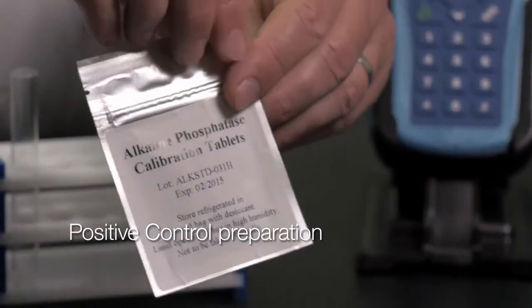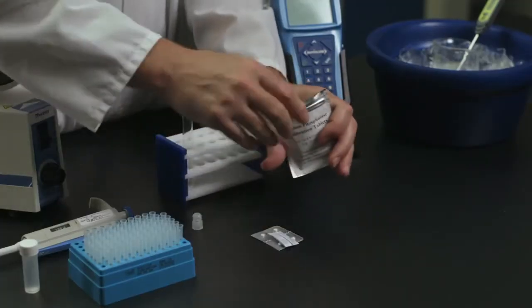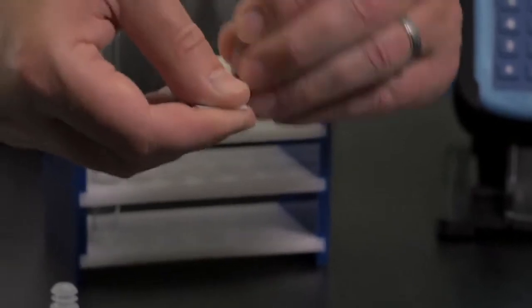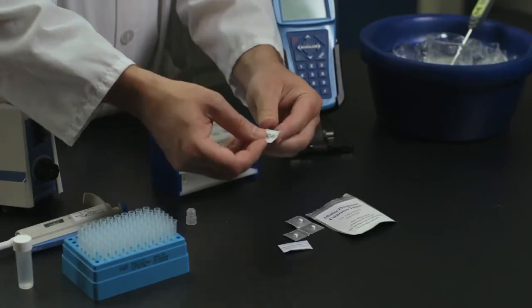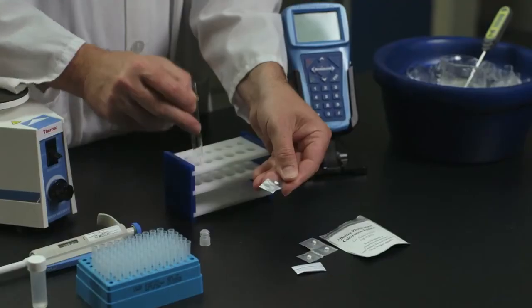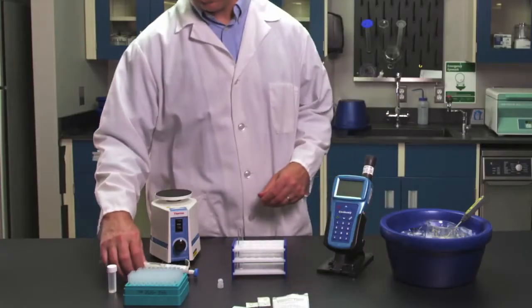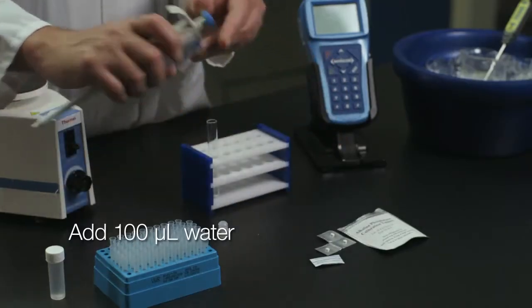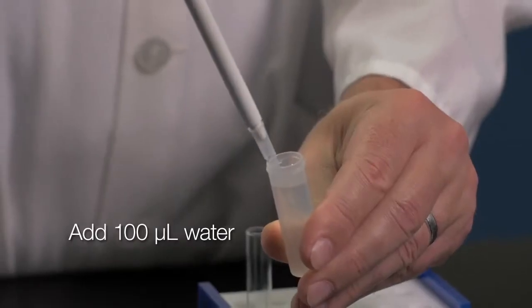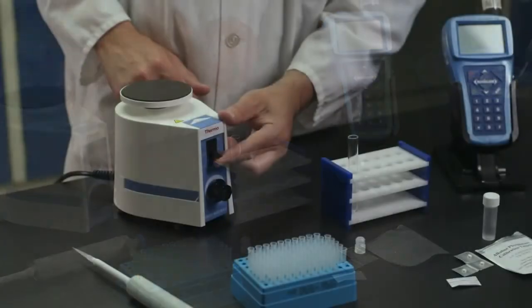To prepare a positive control, add 1 calibrator tablet to a test tube or the supplied mixing vial. Peel foil backing to expose the tablet. Add 100 microliters of water, and mix the tube to break up the tablet.